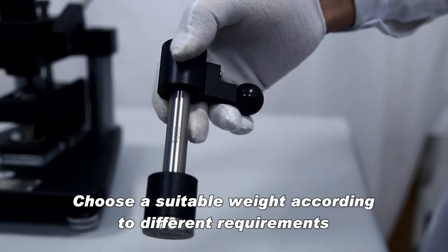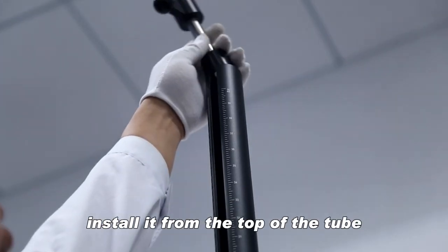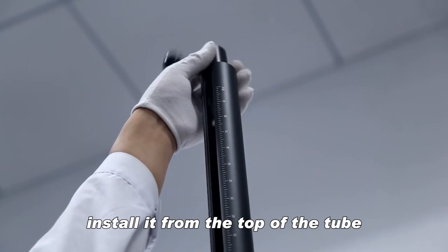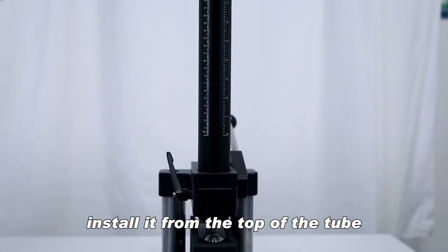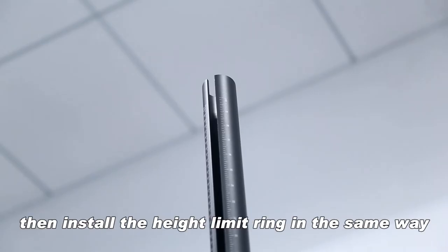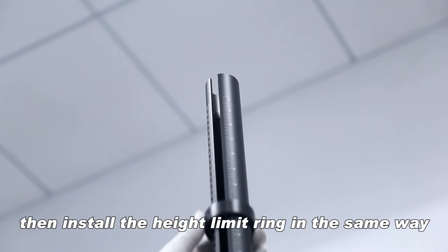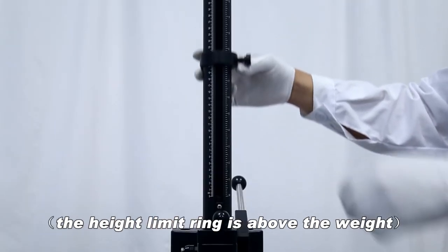Choose a suitable weight according to different requirements and install it from the top of the tube. Then install the height limit ring in the same way. The height limit ring is above the weight.